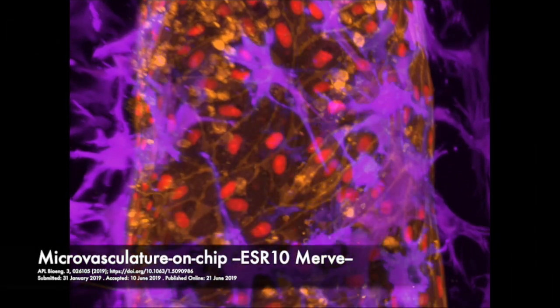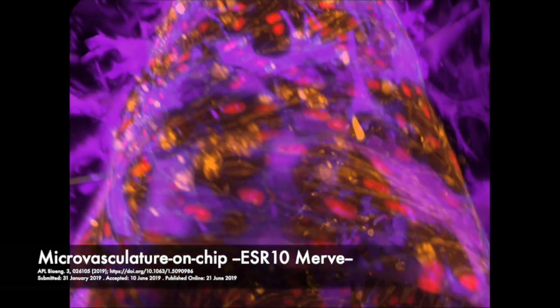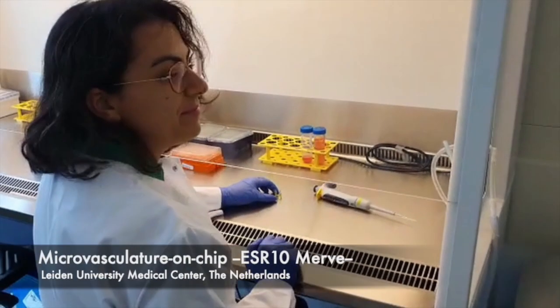Various assays can be carried out to answer different research questions. Here we can have a look at the vessel and chip that ESR10 is working on. With their advanced imaging technique, they can inspect the individual cells that make up their three-dimensional vessel. Now let's hear some of our ESRs explaining their chips.